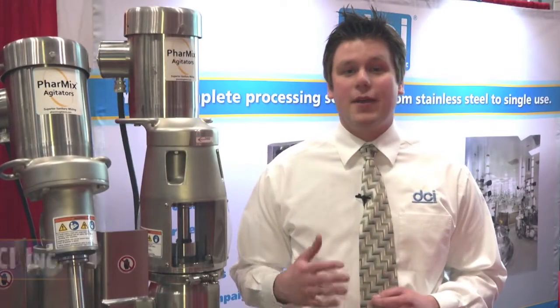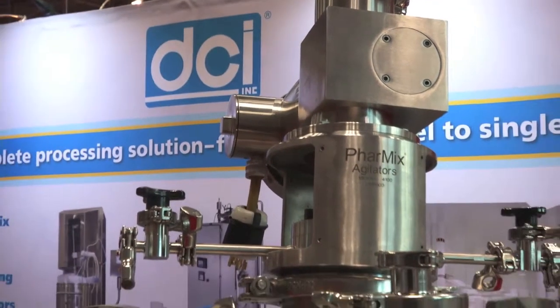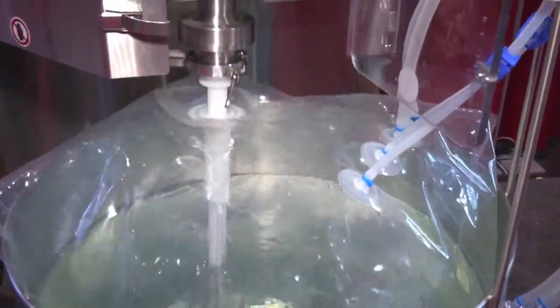DCI has been engineering and manufacturing agitation since 1955, and with this experience we have introduced our own line of agitation to include the Pharmix family of standalone top-entering mixers and the Pharmix SC system, which is a single-use mixing unit.